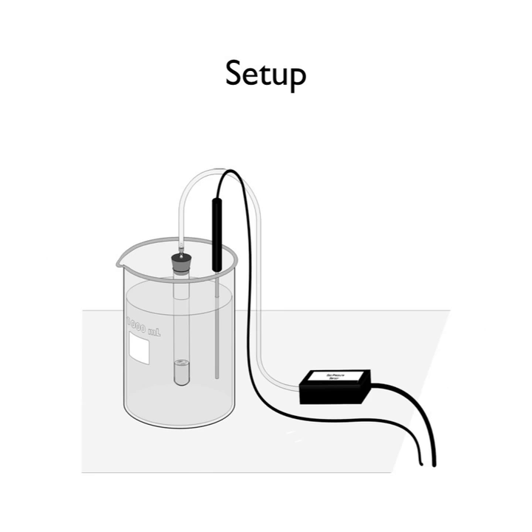Start the Logger Pro program, Experiment 12, peroxide, then remove the test tube from the water bath and remove the solid stopper. Remove the plastic Beral pipette from the water bath and quickly transfer the 1 milliliter of potassium iodide into the test tube. Tap or lightly shake the test tube to mix the reagents. Seal the test tube with the one-hole stopper connected to the gas pressure sensor. Place the test tube back into the water bath. Click Collect to begin data collection.